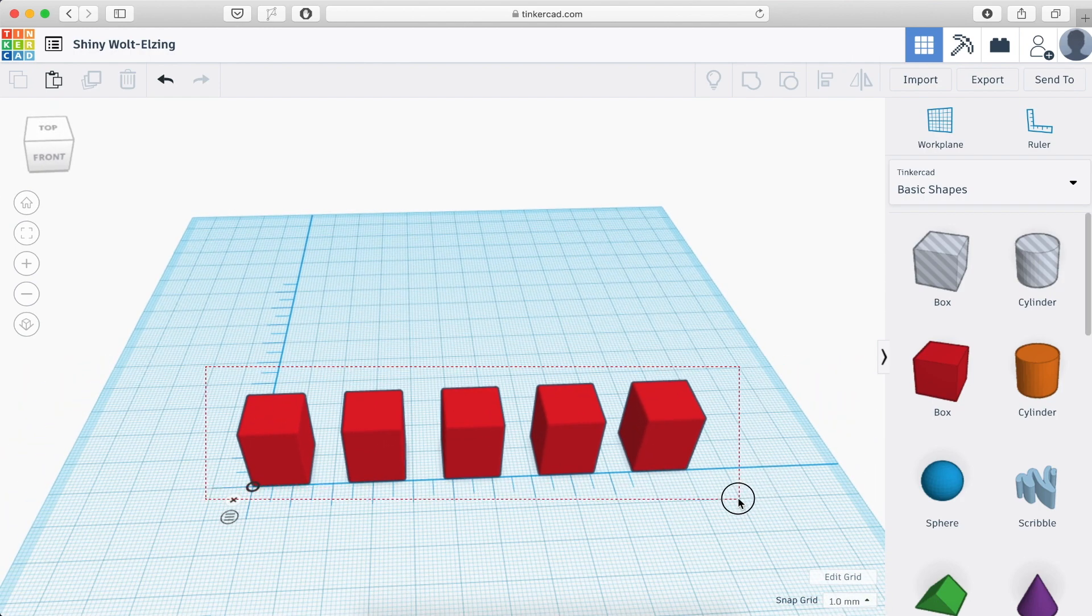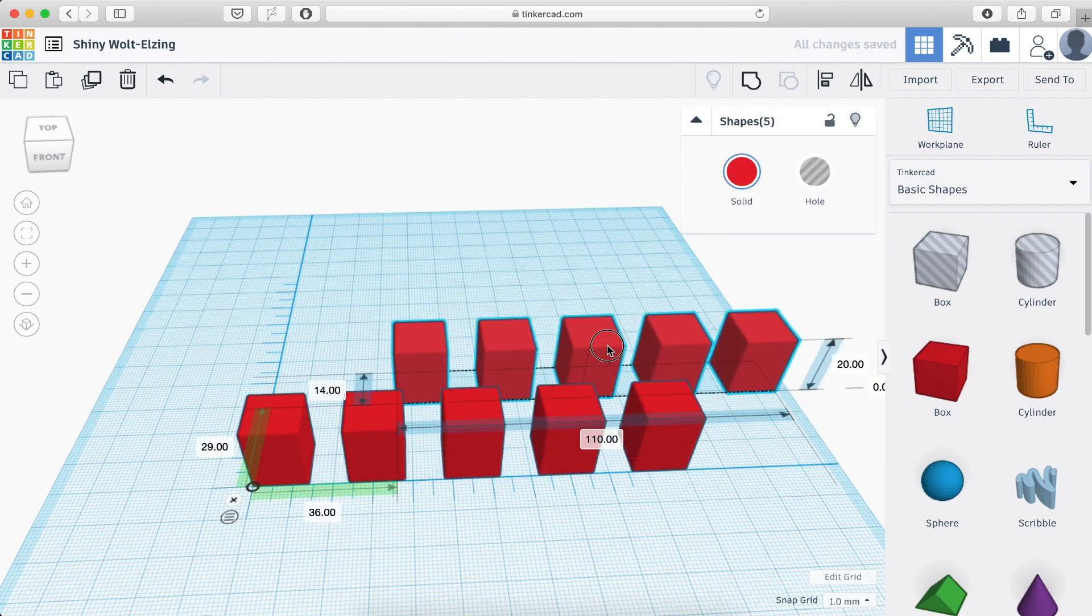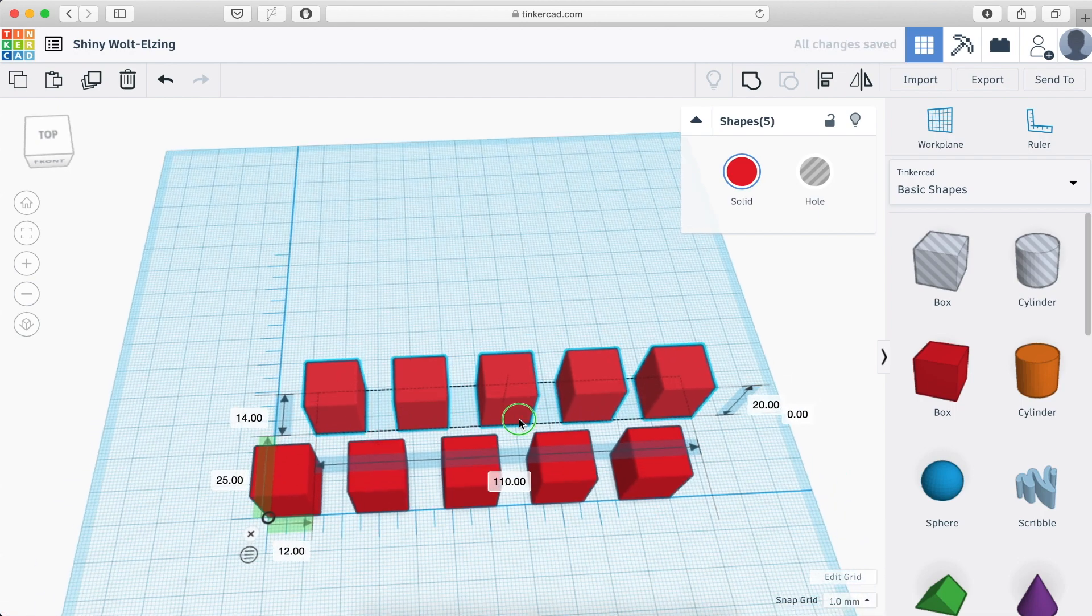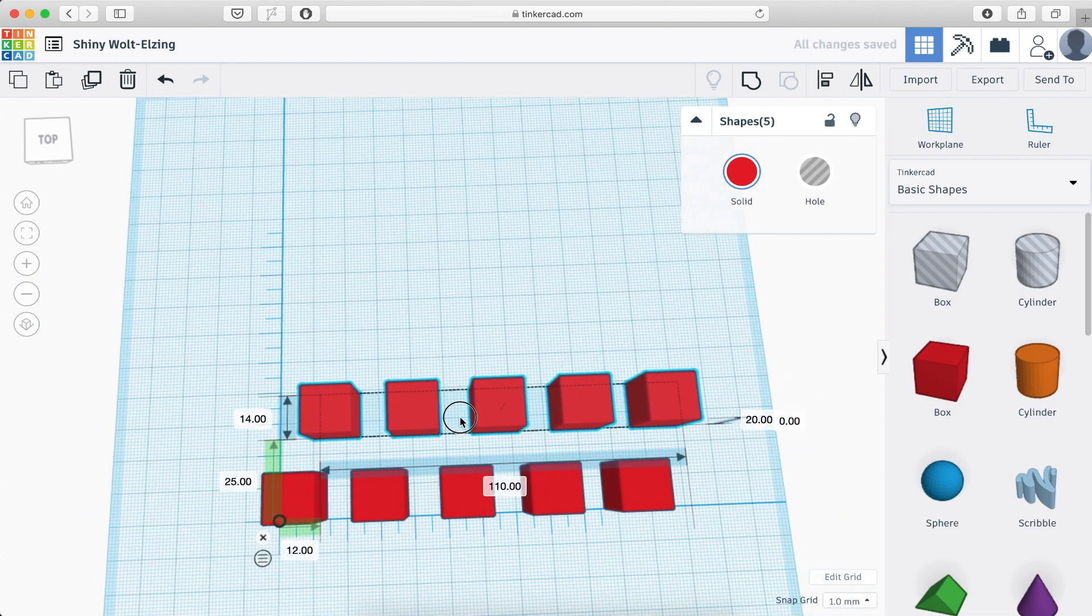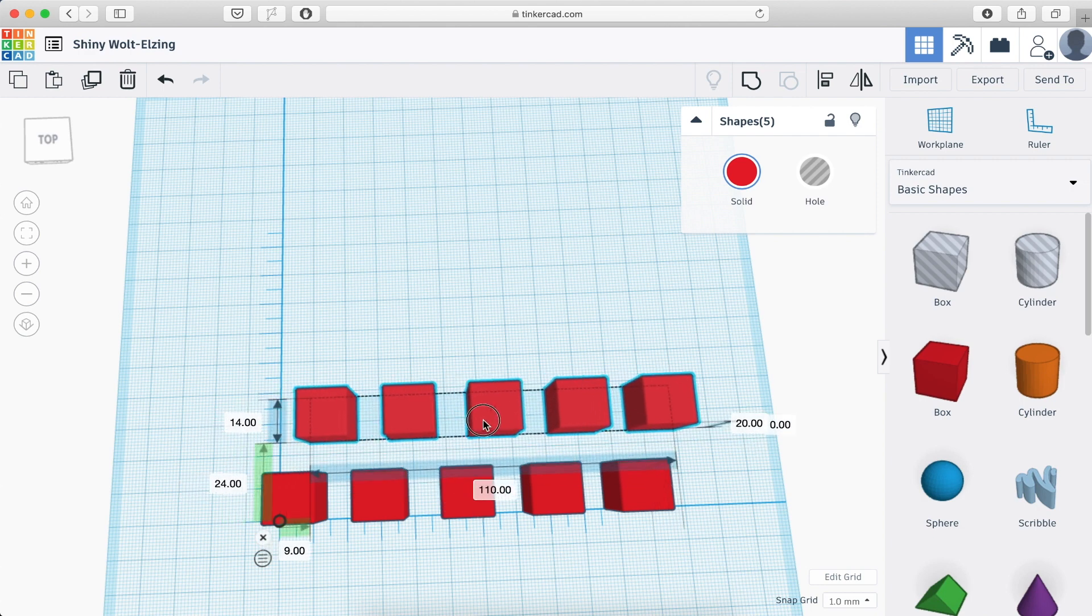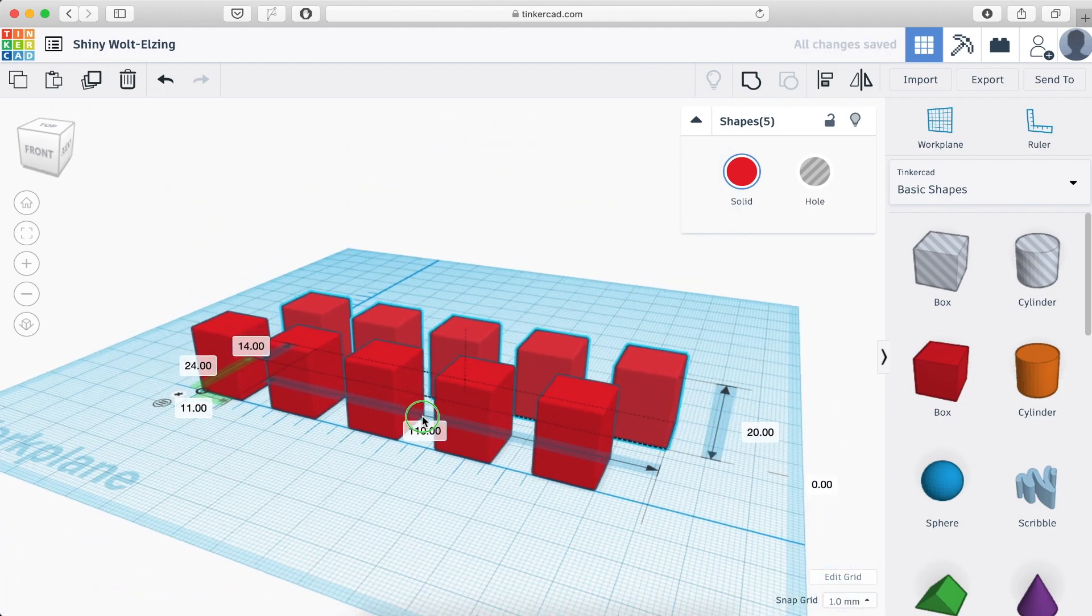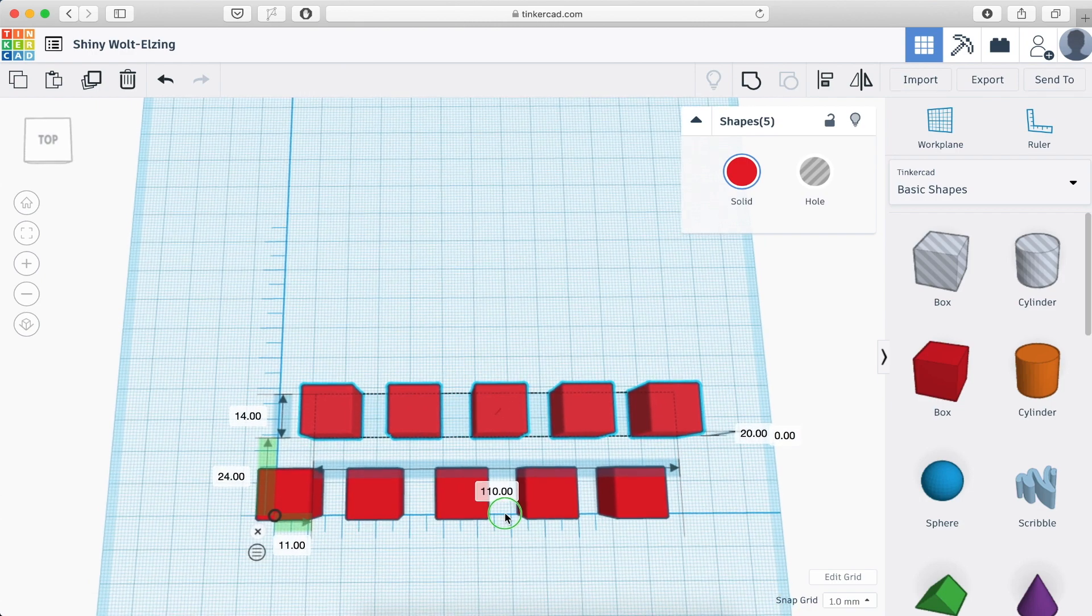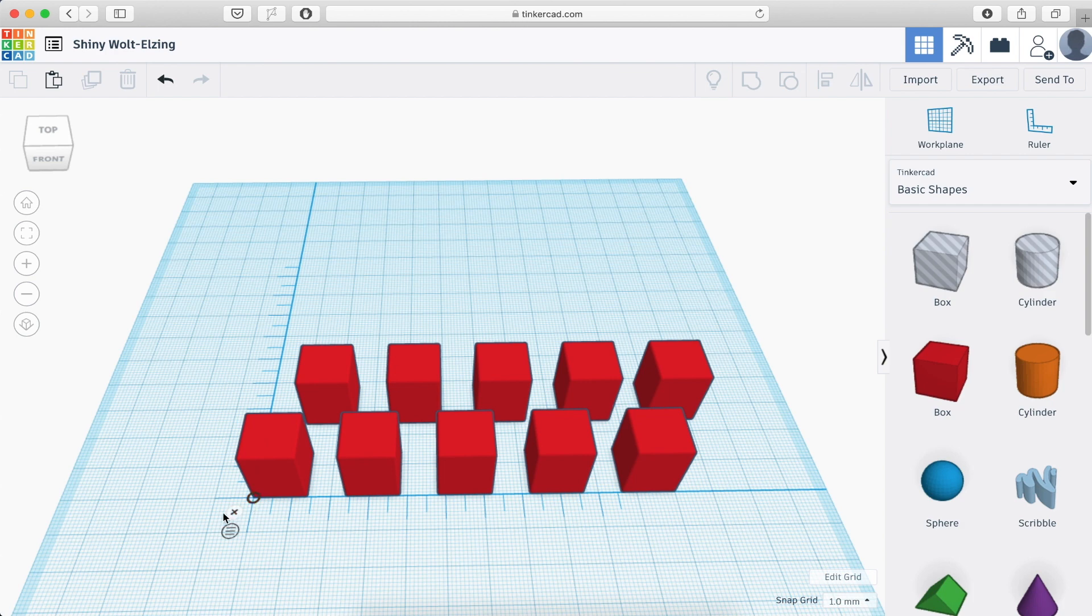Then the other thing that I want to have, because I want to have 10 cuvettes in this holder, I'm just Ctrl C, Ctrl V, paste them and put somewhere more or less here. So I can put them in line, but then my fat finger will not reach them. So I have a problem with that. I want to put them in the middle so I can easily pick them up singularly. This looks nice. I'm just doing it by eye because this doesn't really matter.